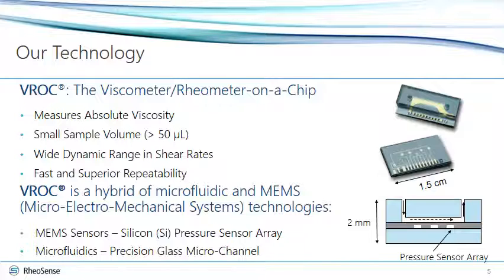So how does VROC work? VROC is a hybrid of microfluidic and MEMS technologies. Basically, we put together a microfluidic channel with a pressure sensor array. As the fluid flows through the channel, we characterize the pressure as a function of position.